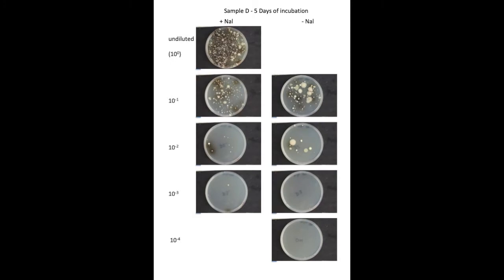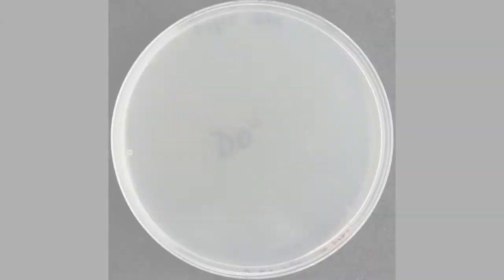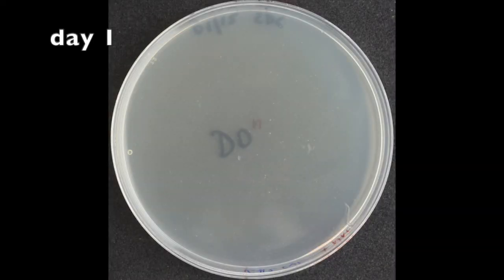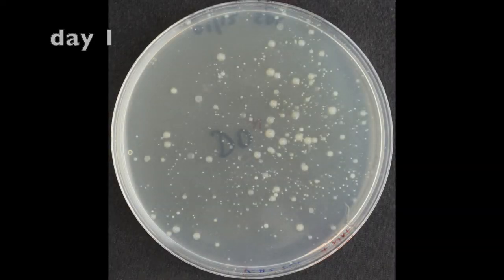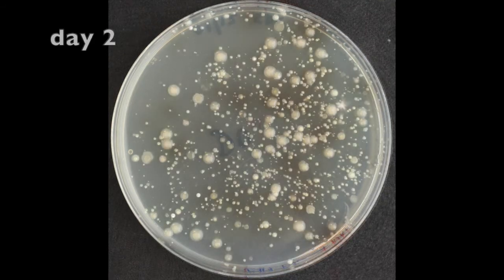Note how some colonies are secreting a brown substance into the media. Close examination of the plates after six days reveals the presence of small colonies with the appearance of streptomyces. Here we focus in on the undiluted sample D grown with nalidixic acid over six days.